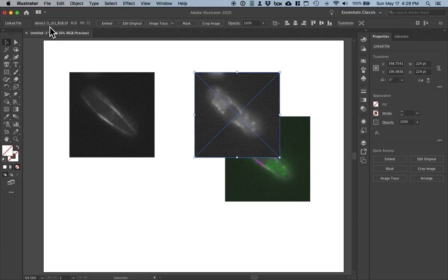So what's interesting now is this is the one I didn't change the name on. So that's number 1. You can see the linked file info up here. It will give me the embed option. Say, okay, fine, embed. This one here, it's not giving me that option. And if you see the linked file, that doesn't exist anymore. We changed the name, so it can't embed it. So even though it's not complaining yet and it's still showing you the image, were you to reopen this file, that image wouldn't be there. You'd have to relink it.